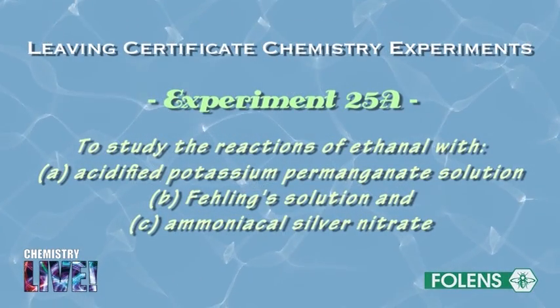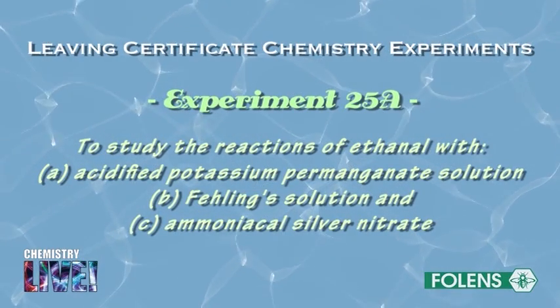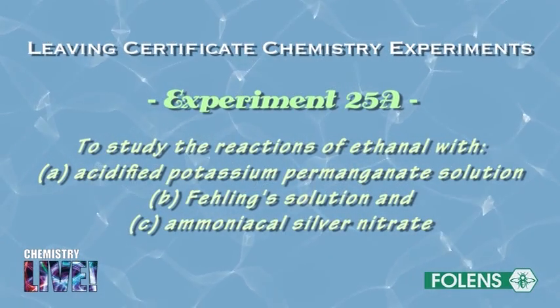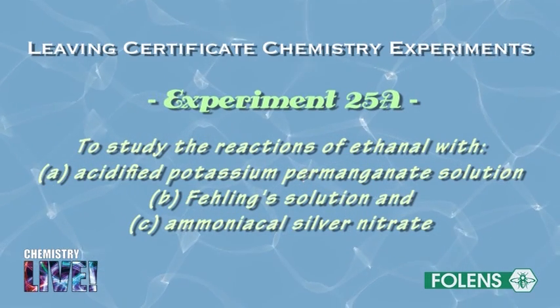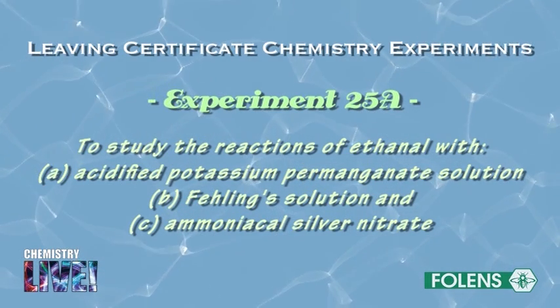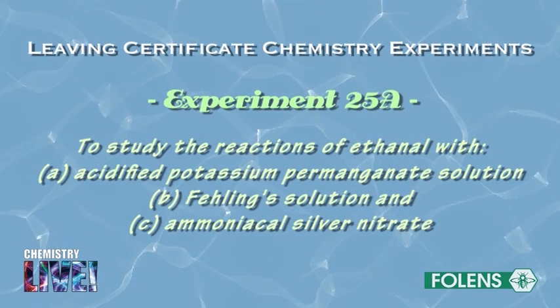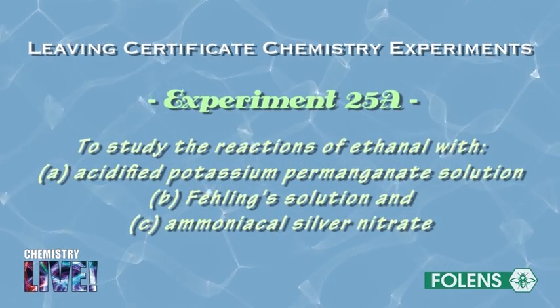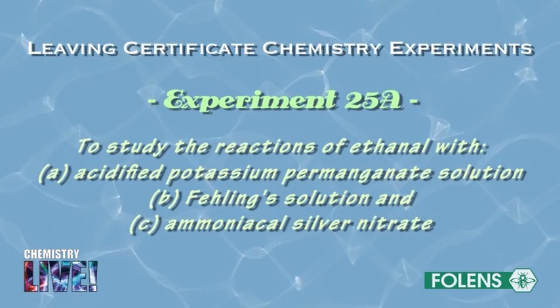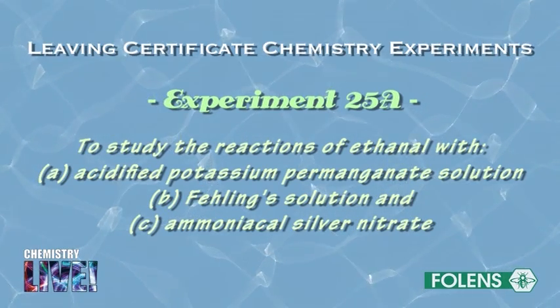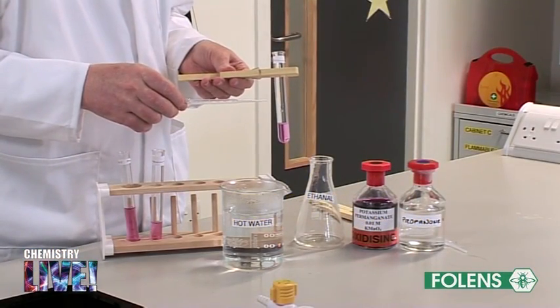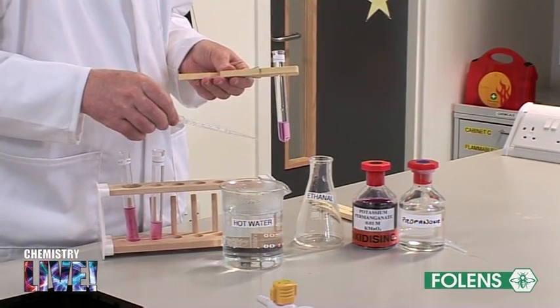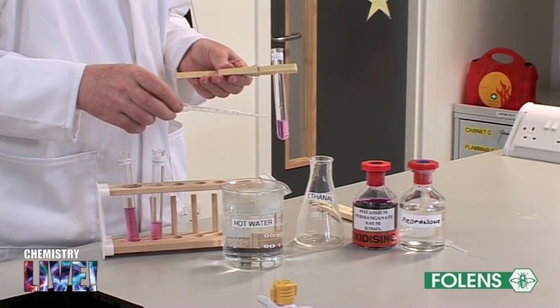To study the reactions of ethanal with: A. acidified potassium permanganate solution, B. Fehling's solution, and C. ammoniacal silver nitrate. In this experiment we will study how ethanal reacts with the compounds listed.